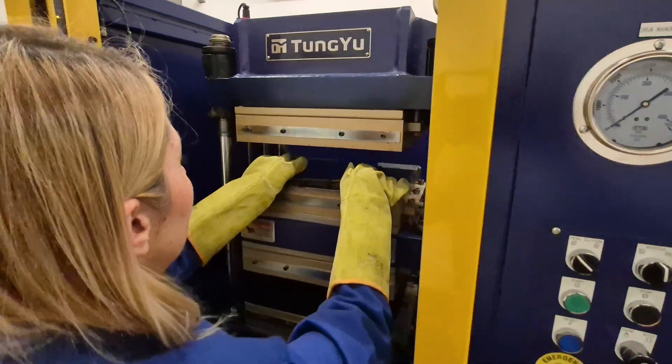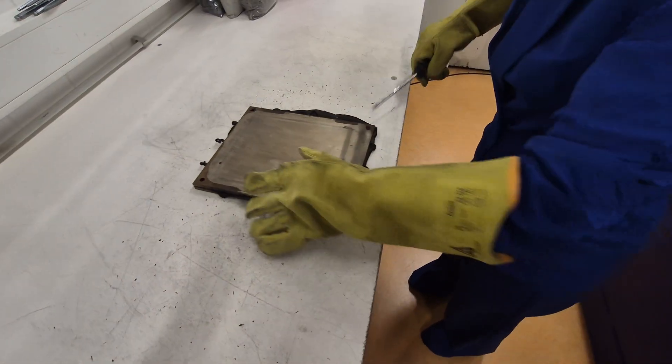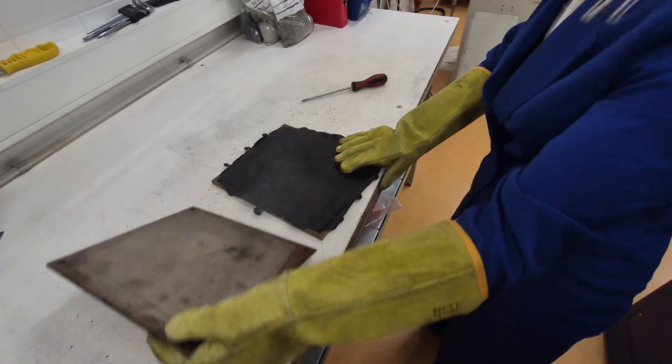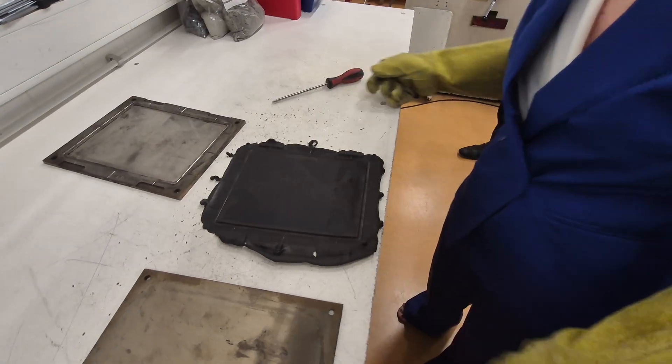A good rule of thumb is to take the T90 from the MDR and add about 20 to 30% to account for heat transfer into the bulk of the part. So if your MDR says T90 is 8 minutes, you would probably start with 10 minutes in the press.